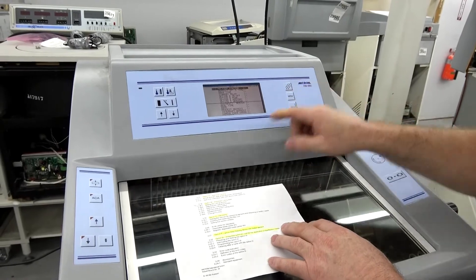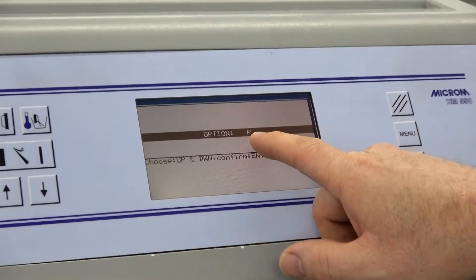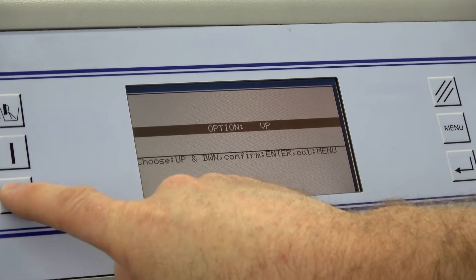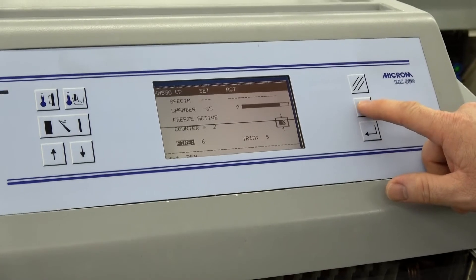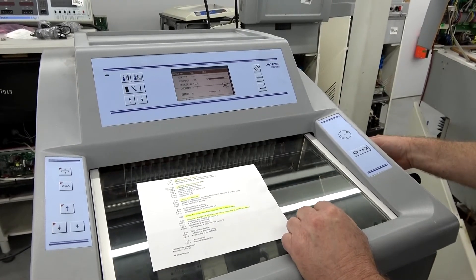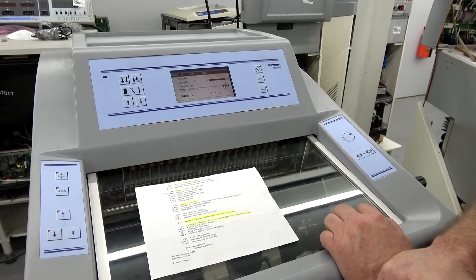I need to turn the vacuum back on again, so we'll go back to menu, push up on the button, push these two keys when under service, hold it, go back to option set, hit enter — I'm back to option P. Now I want to toggle back to where it has P and V. There it is — vacuum tome and peltier. Those are the options this machine has. I'm going to hit enter to save this, go back, and now my vacuum tome is turned on. I turn it up — it's a bit quiet but it's now turned on, and if I open the door it would probably be a little louder.